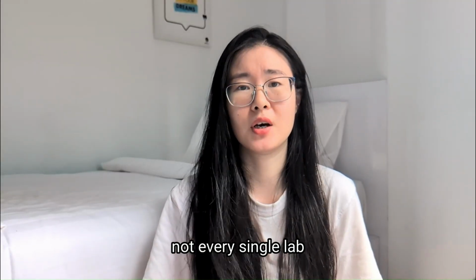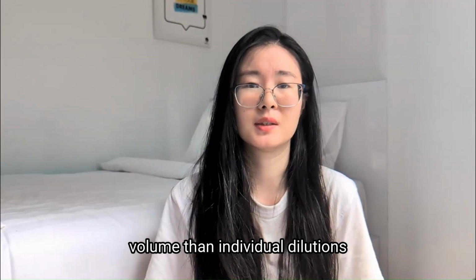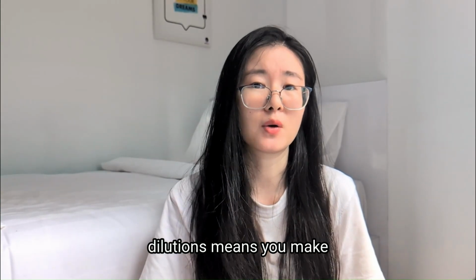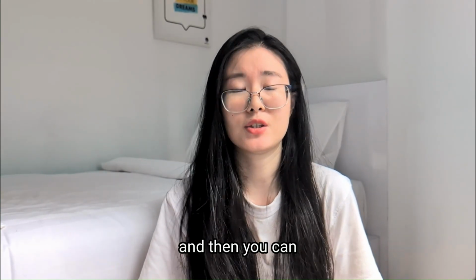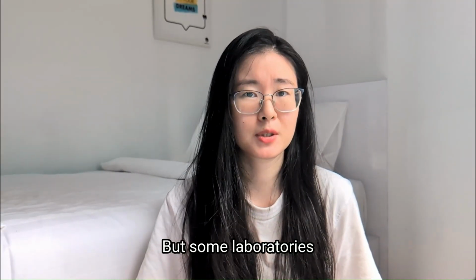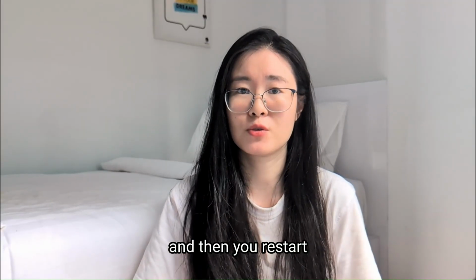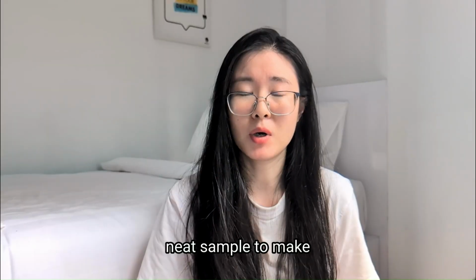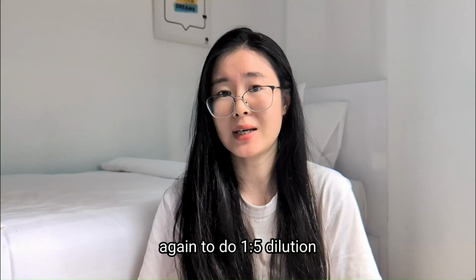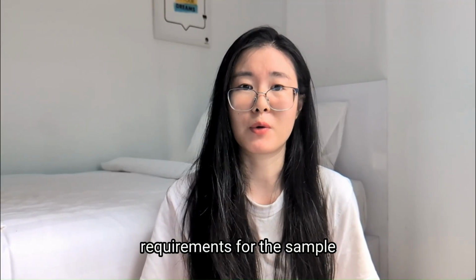And unfortunately, not every single lab allows series dilutions. That requires much less volume than individual dilutions. What I mean by that is a series dilution means you make one dilution of, say, 1 to 2, and then you can use that 1 to 2 dilution to make 1 to 4 and then 1 to 8. But some laboratories don't allow that. They only allow you to make a 1 to 2 dilution, and then you restart fresh, using the neat sample to make a 1 to 3 dilution, and then use the neat sample again to do a 1 to 5 dilution. That type of requirement ends up with even higher volume requirements for the sample.